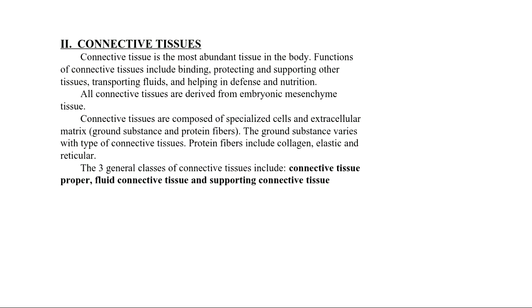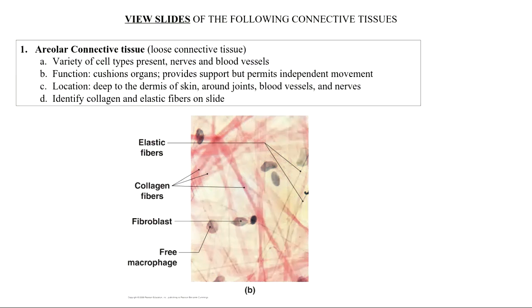All right, so we'll start with areolar connective tissue, which is sort of a loose connective type of tissue. We see this throughout the body. For instance, that stratified squamous epithelium that represents your skin that we just talked about attaches to an areolar connective tissue. So it's going to provide a lot of support and cushion for the body, but it has all sorts of things in the matrix of this areolar connective tissue, which again is gone over in great detail in lecture.